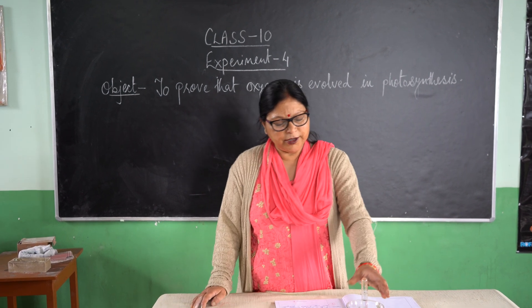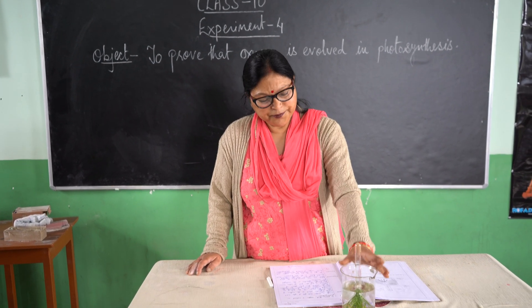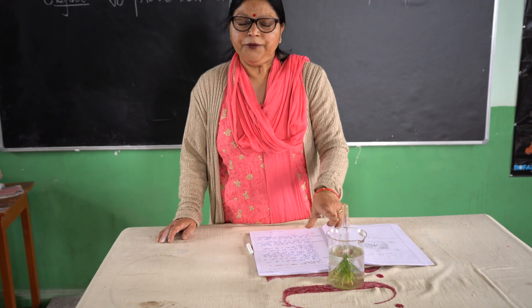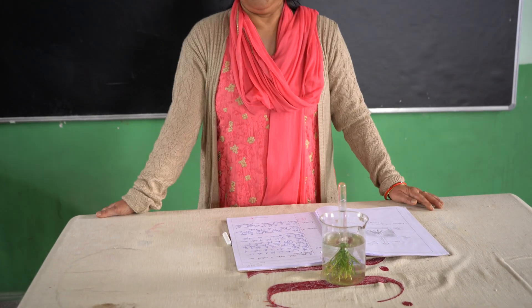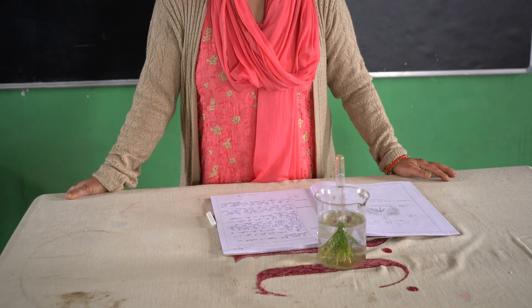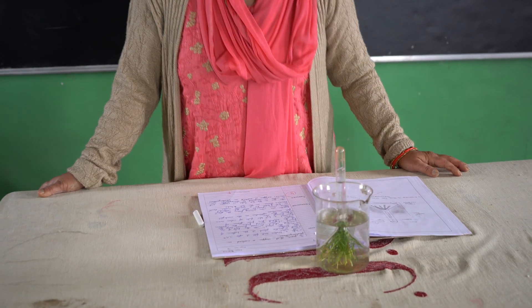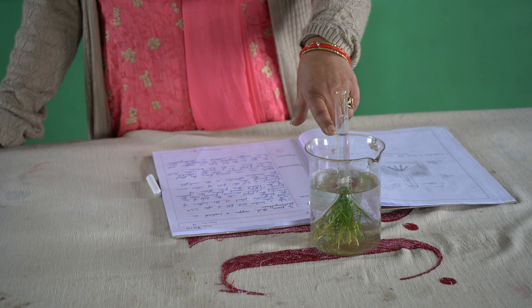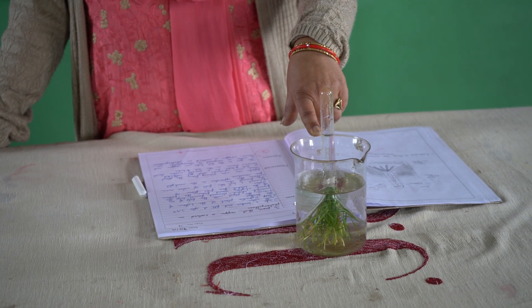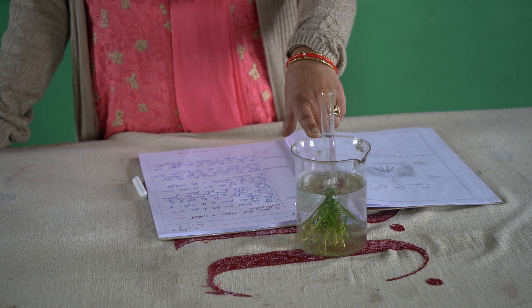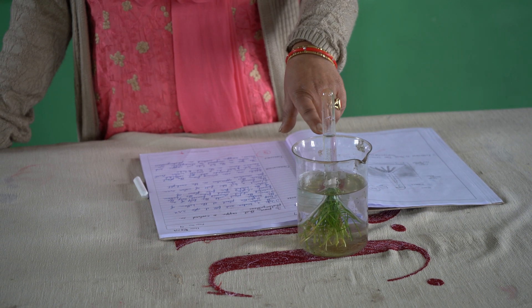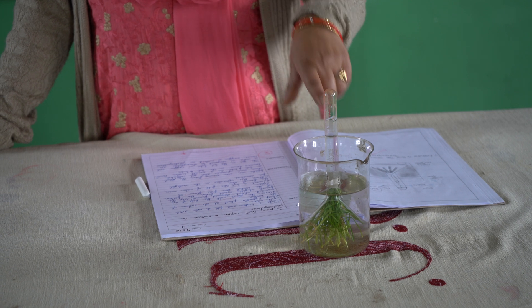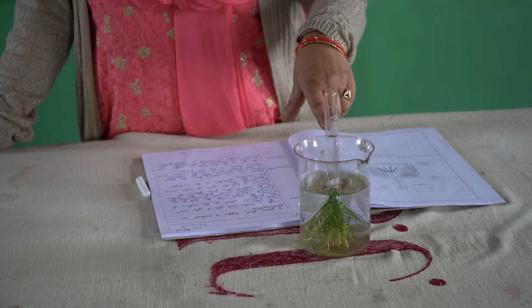For this experiment, we have taken a beaker filled with water. We have used an aquatic plant, that is Hydrilla. This Hydrilla is kept inside and covered by a short-stemmed funnel, and then a test tube filled with water is inverted and placed on top of the funnel.